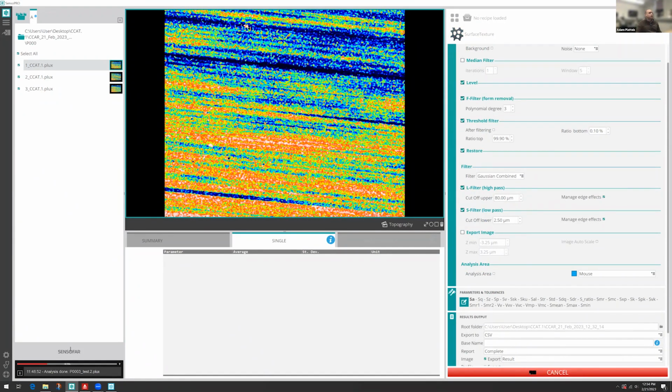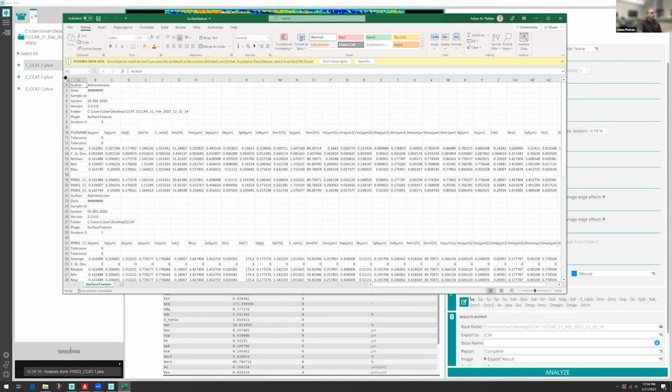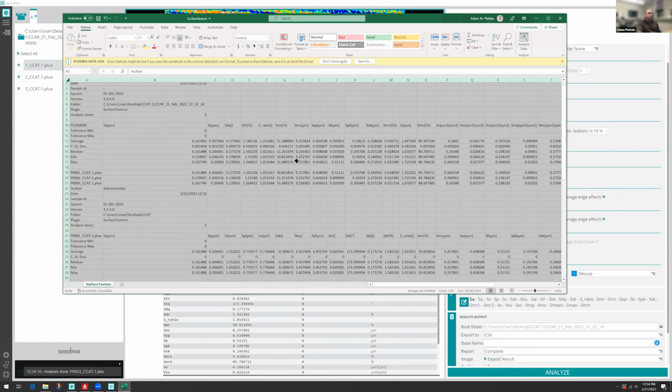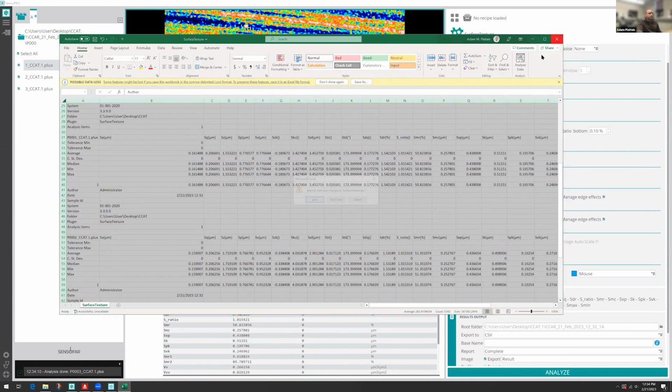all the values. So the microscope just went through and imaged all the samples, which shows that they're actually all out of tolerance to what I've set. But you have the report here that you can come back to and check in your manufacturing process any sample that might have been flagged as a failure. And then if none of them were flagged, you can say your sample batch run was a success.